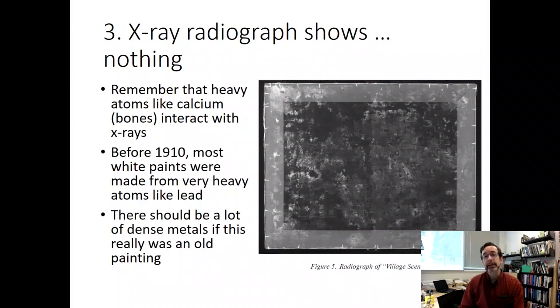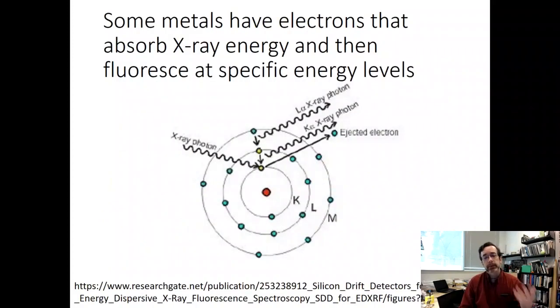So now we've got 3 techniques that we've gone through. So I want you to remember about X-ray fluorescence. They're going to apply that technique next. And remember that there's a whole thing where you have X-ray photons coming in. They move electrons around. Each element has distinct energy levels for their electrons. This means that the electrons coming off are also in the X-ray region in many cases. And the color, the wavelength of the X-rays that come off, will tell you which element is there.